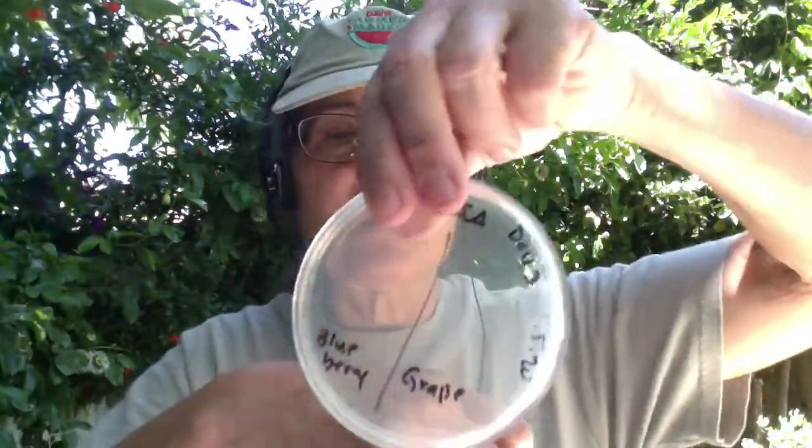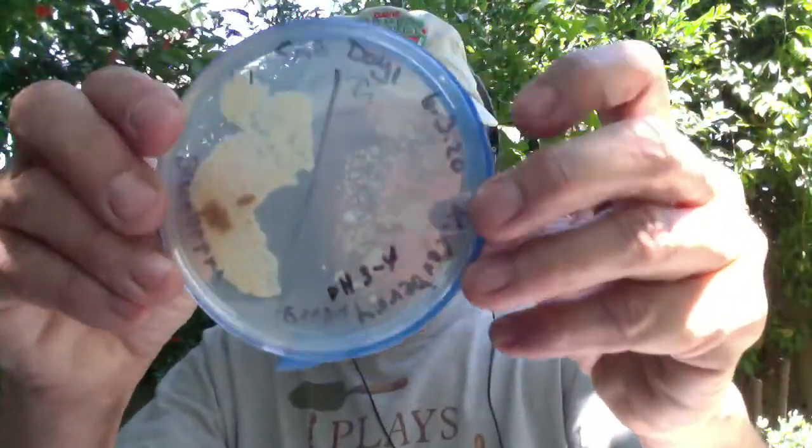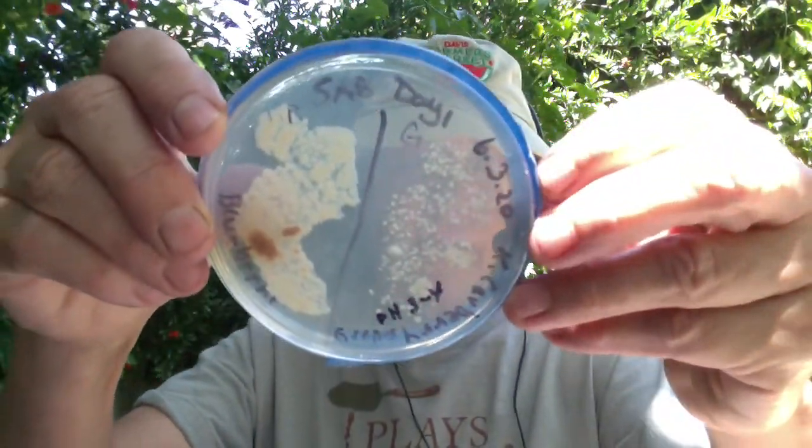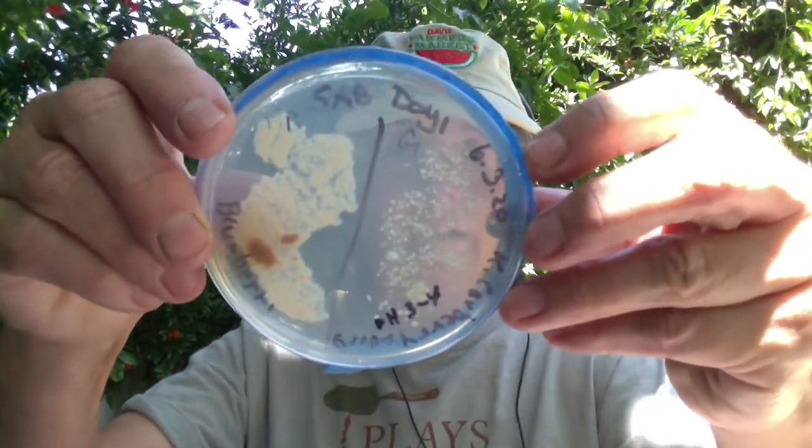So what we'll do, folks, is I'll take samples. This would be our day 3 after 48 hours of incubation, and I'll take samples and streak to a new TSA plate. And then again, folks, you'll recall that we also plated our samples to Sabouraud's dextrose media, SAB media, and this is selective for fungi, meaning it should inhibit most of the environmental bacteria and permit the growth of fungi, and yeasts are unicellular fungi.